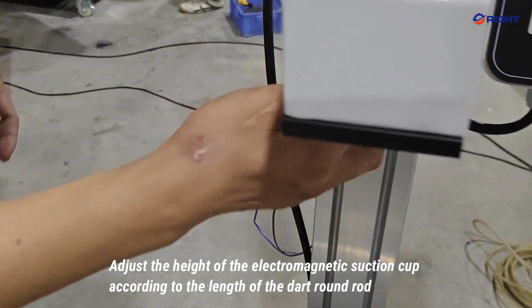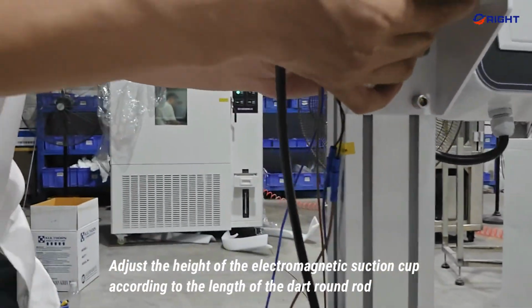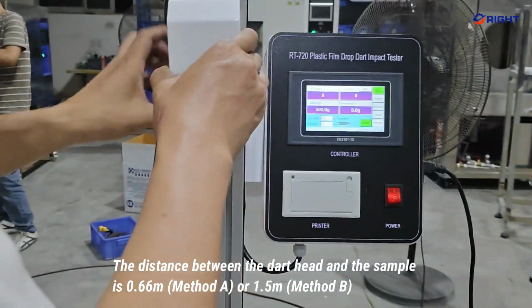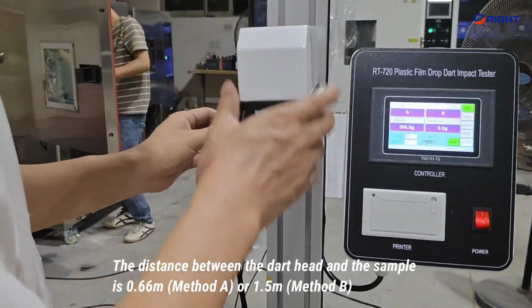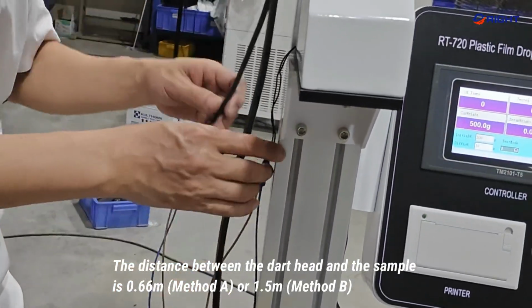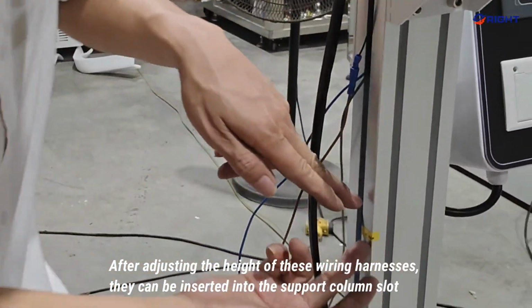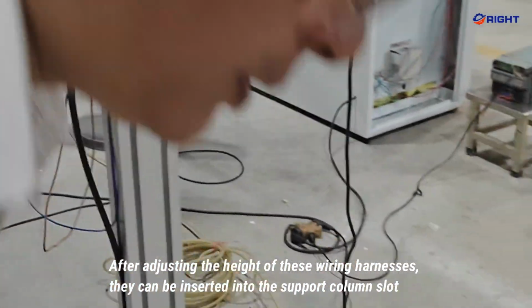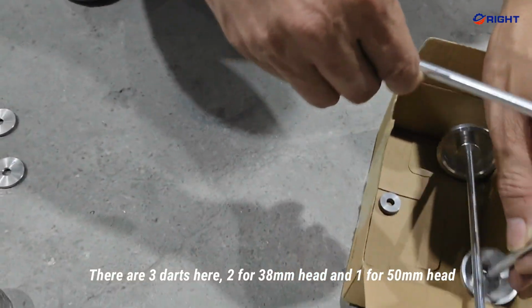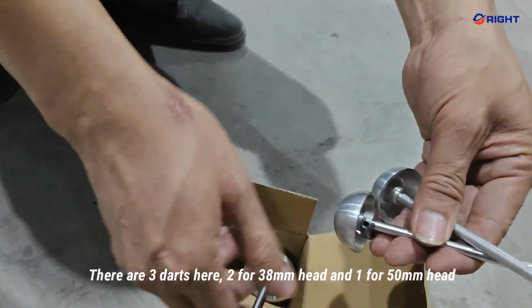Adjust the height of the electromagnetic suction cup according to the length of the dart round rod. The distance between the dart head and the sample is 0.66 m for Method A, or 1.5 m for Method B. After adjusting the height of these wiring harnesses, they can be inserted into the support column slot. There are 3 darts here, 2 for 38 mm head and 1 for 50 mm head.